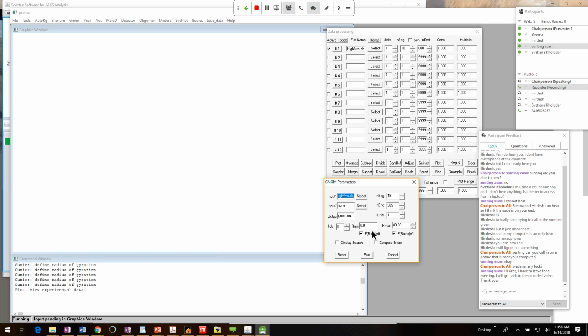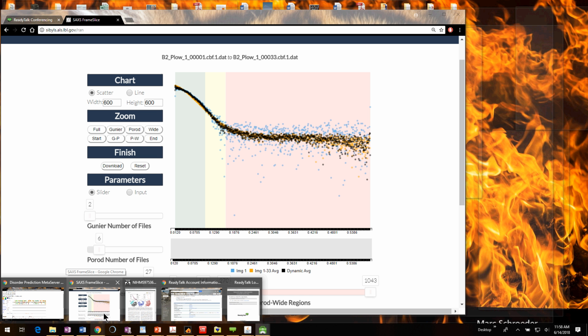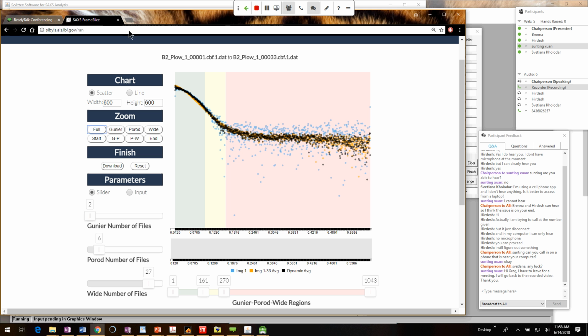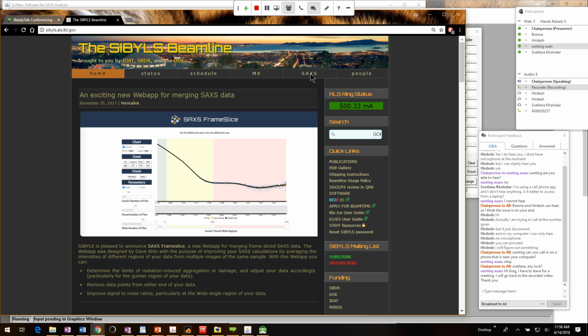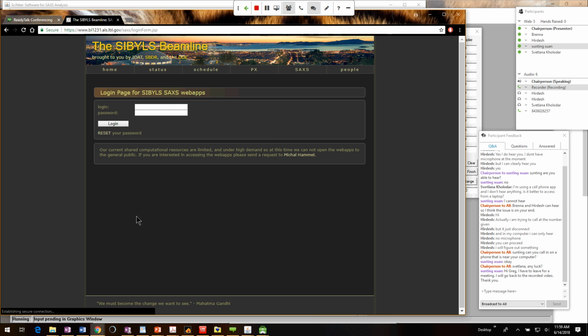There are many ways of doing the shape restoration. You can use our cluster, which has the programs available. So you can use your login for this. So if I go here to SIBYLS, Dmitri at EMBL also has a server for running this, and there are also other servers around. But we've got this additional SAXS web apps here. You log in with what you have. I've got to remember my password.